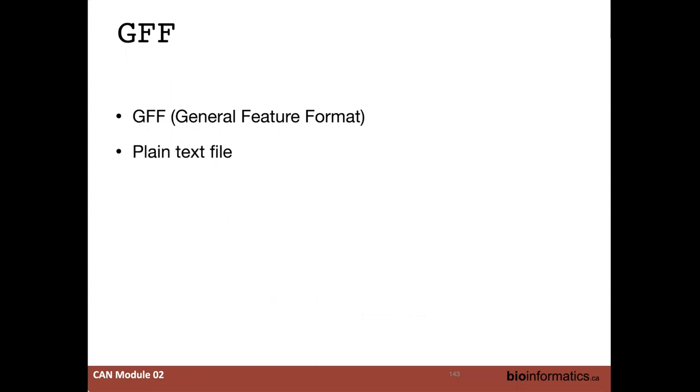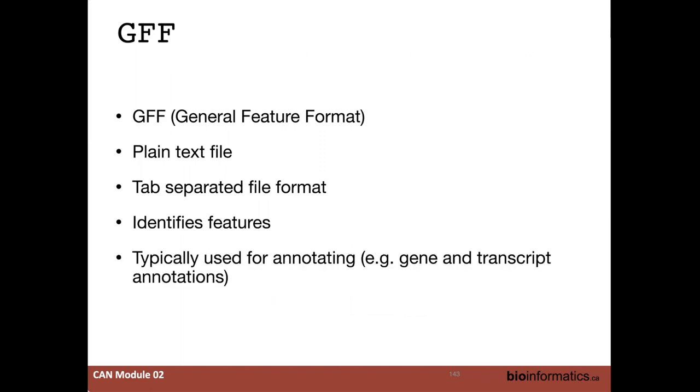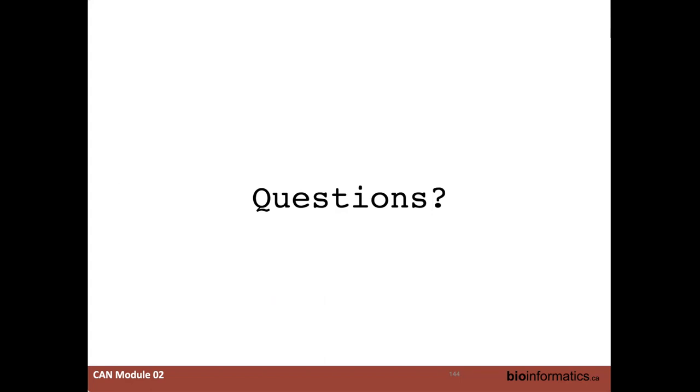General feature format, it's a text file, it's a tab-separated file, identifying some features. Okay, you'll be using it a lot. You good on that? Sorry, I ran through those two really quickly just because I'm trying to finish this off. But the ones that I really wanted you to get more introductions on were the FASTA, which not many people are really going to be talking about in this, FASTQ, and then again, the SAM and the VCF, which are the real key important ones.